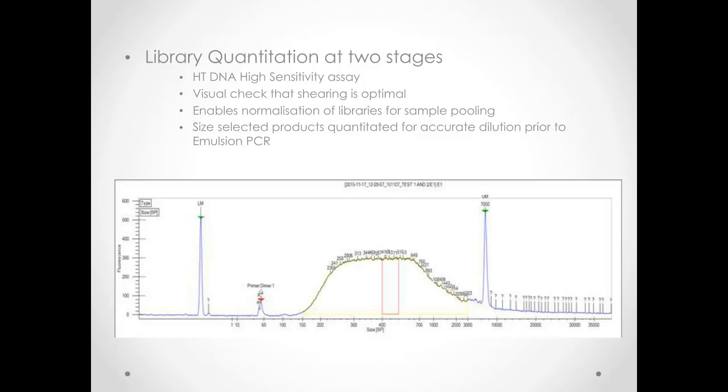And again, all of our samples are tracked through the database whilst they're on the lab chip, and then all the information goes back into our database when we've got that information out the other side. It also means no manual transfer of samples is required in any of the steps, and only one microliter is used by the lab chip. For this precious sample, we only have 20 microliters at these stages, and so taking 5 microliters out for a gel is not ideal.